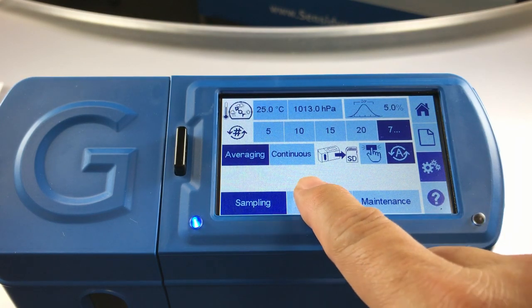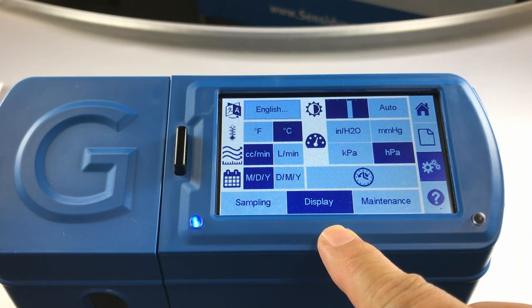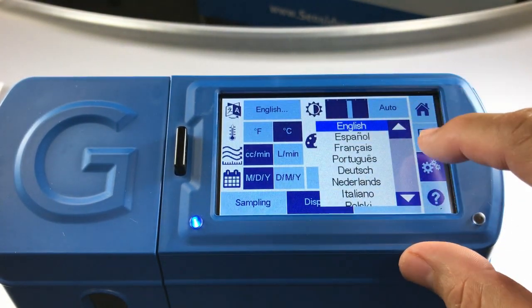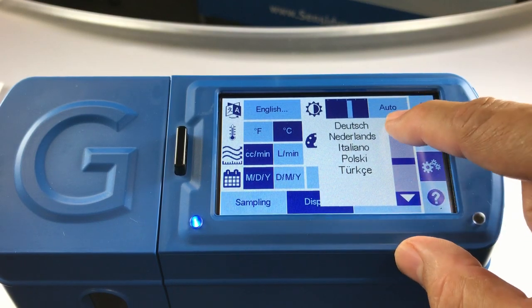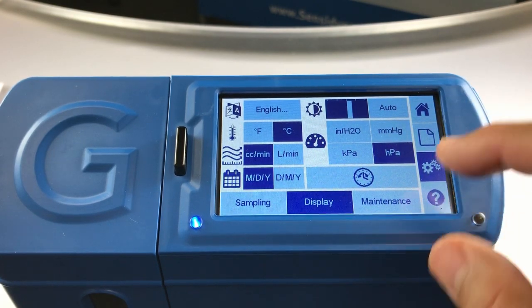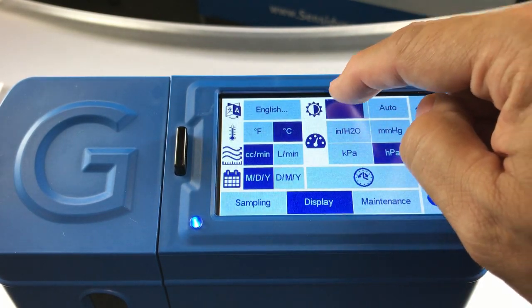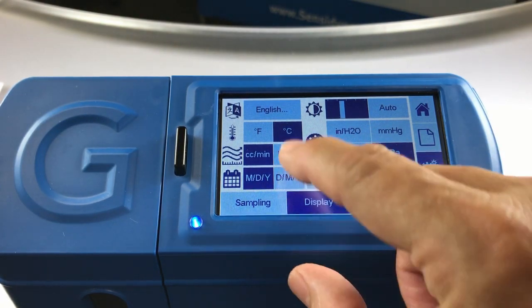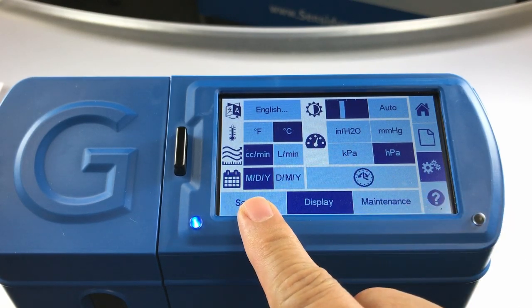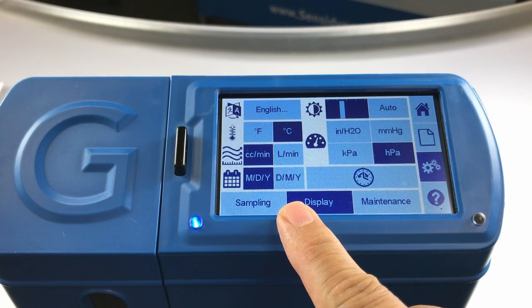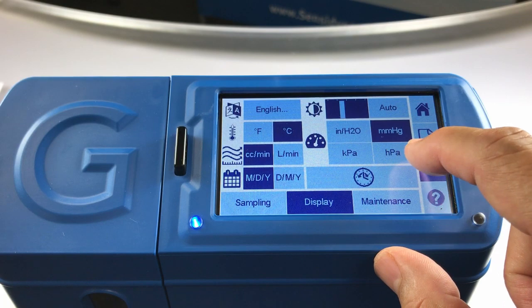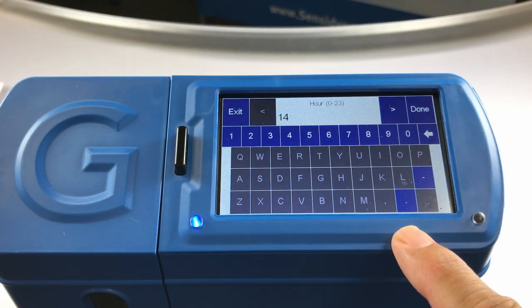Next, we'll look at the display screen. From the display screen, you may select your language by scrolling through a list. You must select your language to advance. You may also choose a brightness scale, or choose a unit of measurement between Fahrenheit or Celsius, cc's per minute or liters per minute. You can choose your date format — month/day/year or day/month/year. You may also choose your units of pressure from four options, and set the time and date for your local destination.